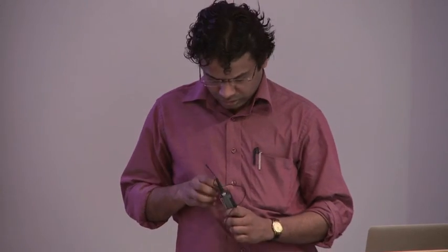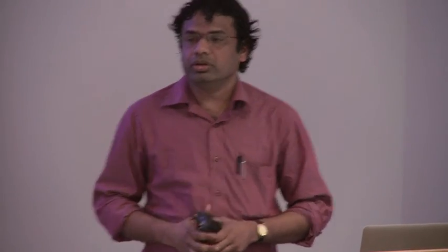Leo? With the smaller molecules, is there a theoretical limit to the precision of the orientation determination, or can it be theoretically improved? Yeah, I think there is no limit. I think Richard can tell you that you can orient as small as 40 or 50 when the techniques develop. But I think with the present advancement, 150 is the limit, I would say.